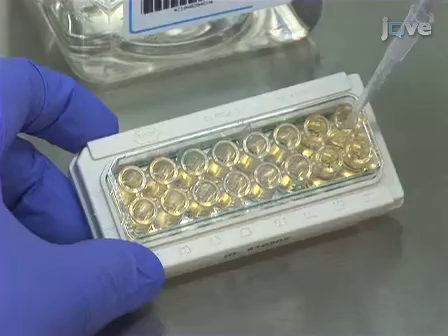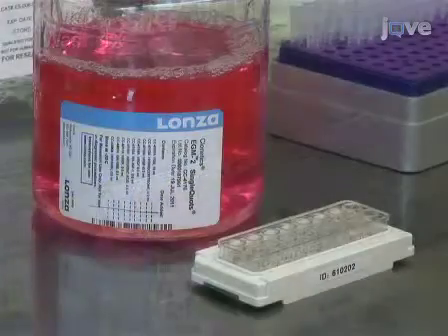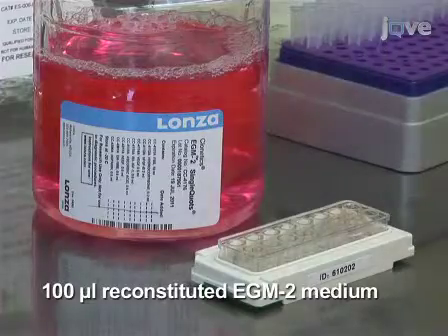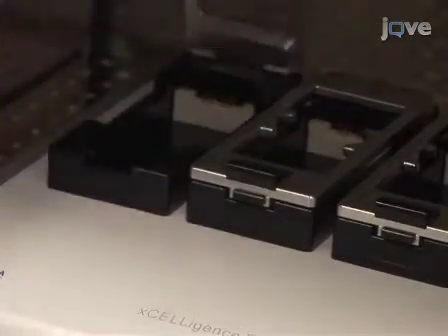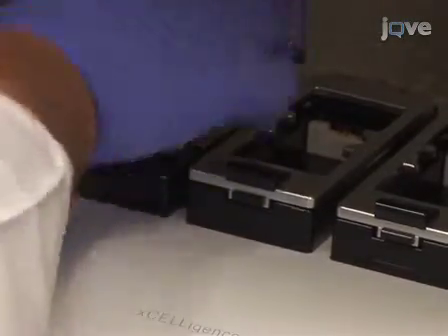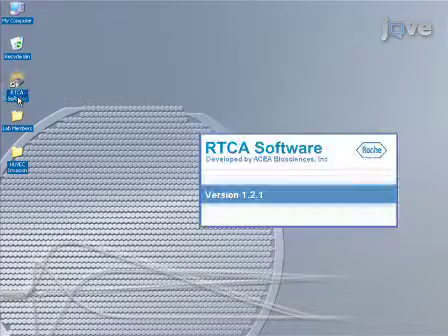Once the plate has been coated, wash it once with PBS, then add 100 microliters of reconstituted EGM-2 medium. To perform a blank reading to measure background impedance in the absence of cells, place the E-Plate in the Accelogenz system. On the computer, open the Accelogenz software by clicking on the RTCA software icon on the desktop.